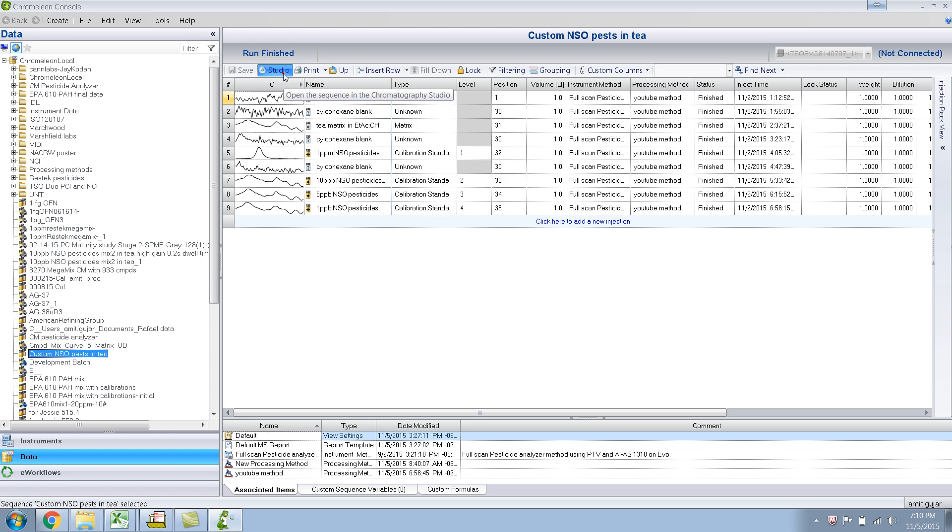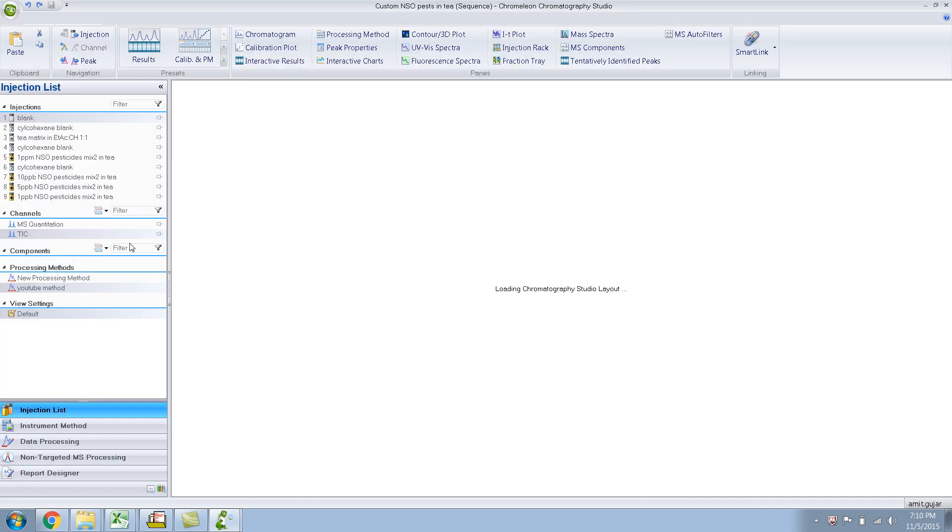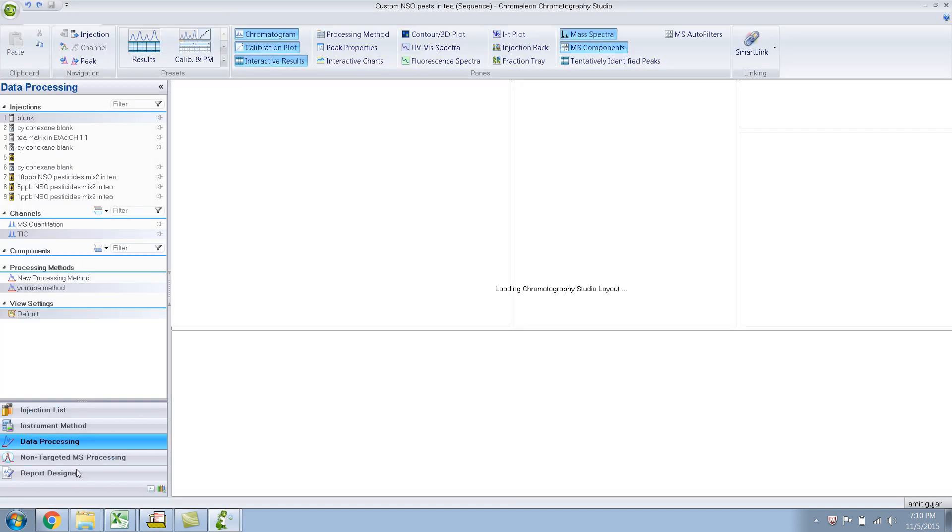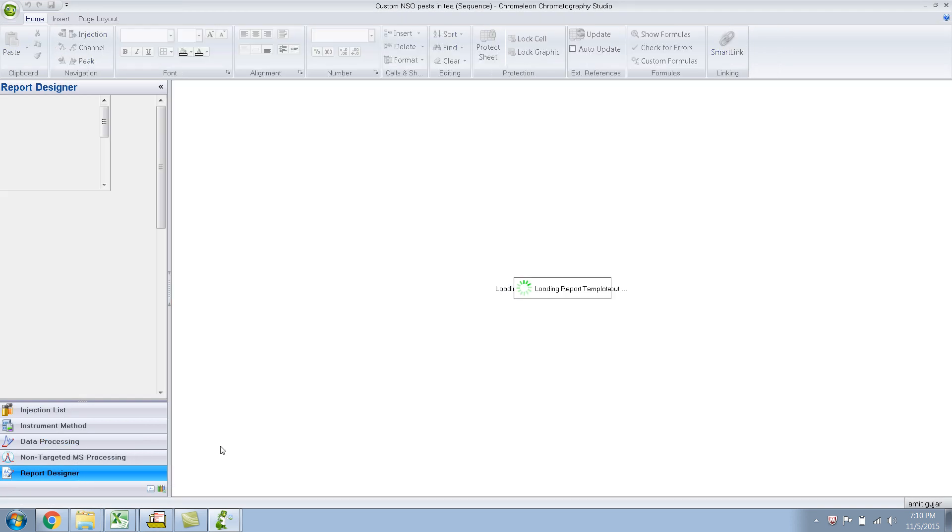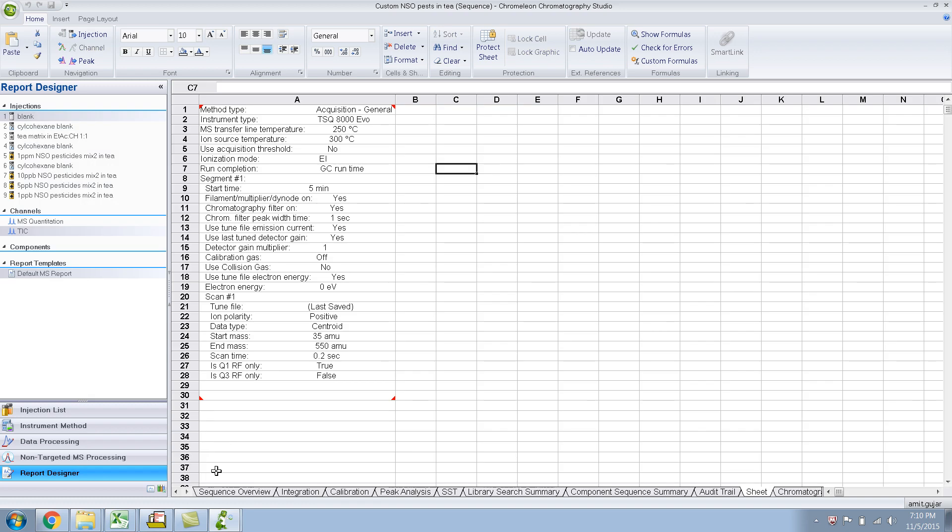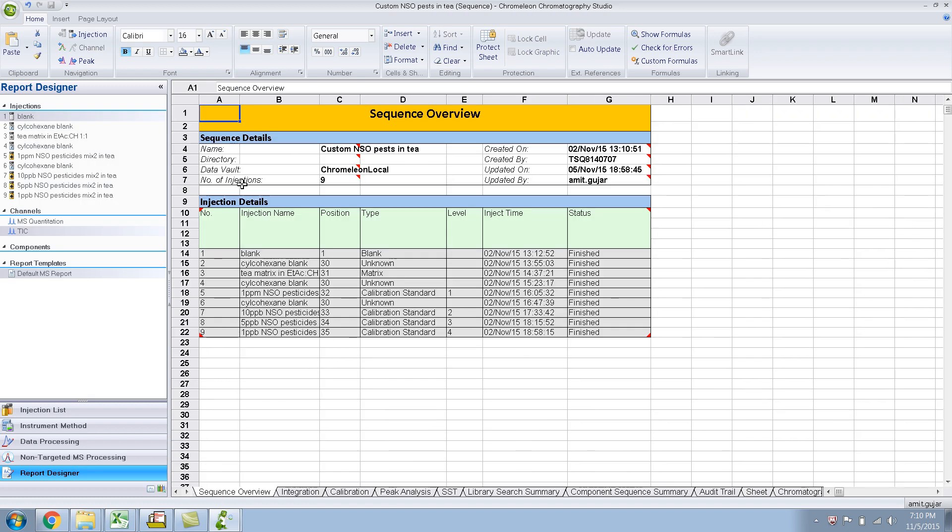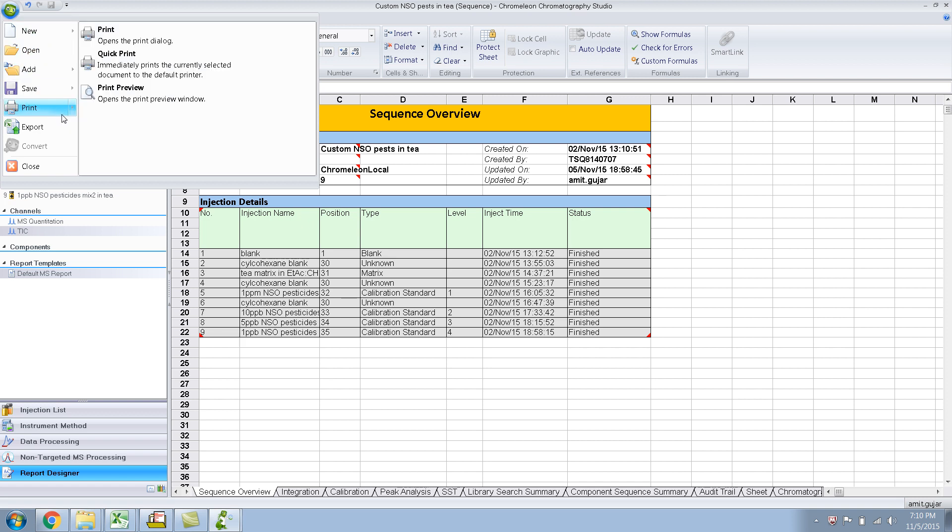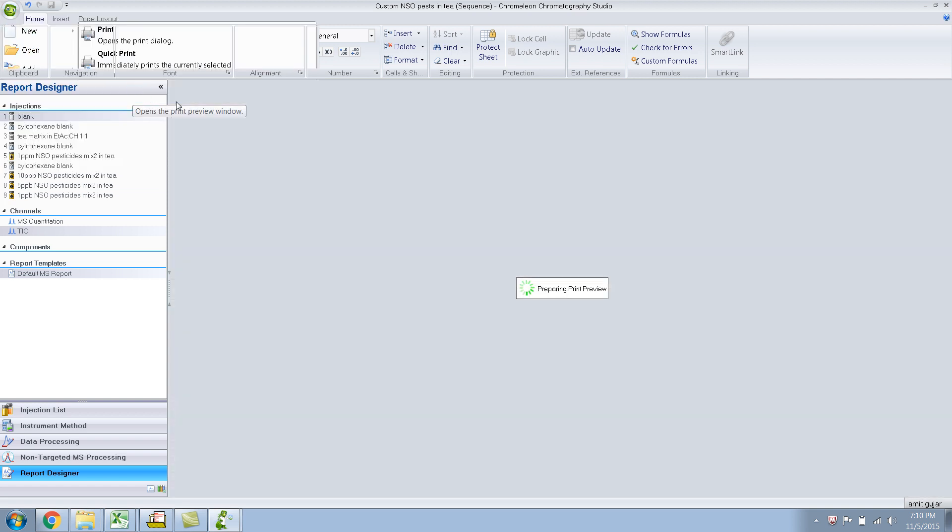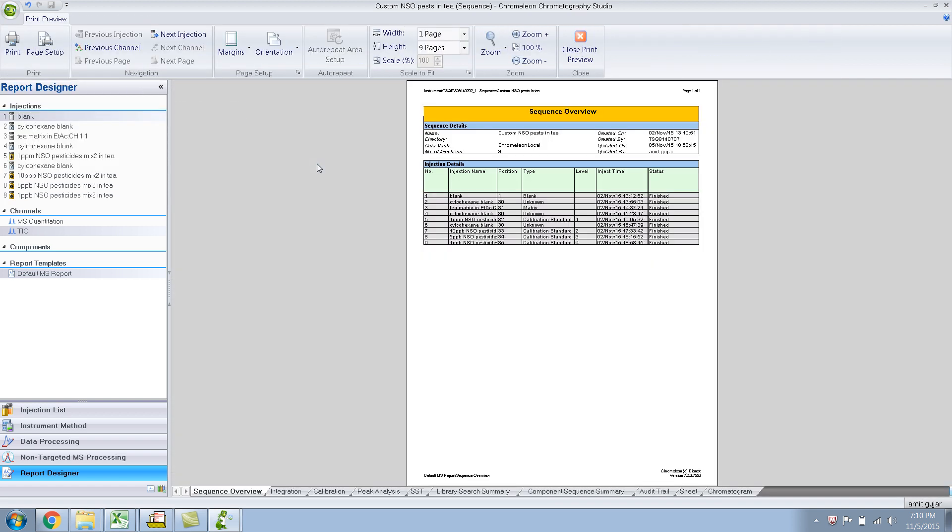So let's go to the studio, report designer. And this was the report page. And you go over here, print preview. And there you go, he's gone.